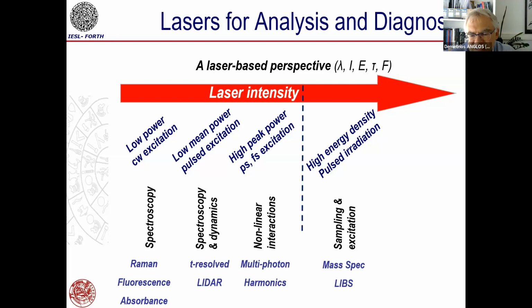If the energy is higher, not only do we remove material, but also we excite this material. And in that case, we form plasma, and we generate a different technique, which we call LIBS, laser-induced breakdown spectroscopy, and we'll give a few examples of this in a while.